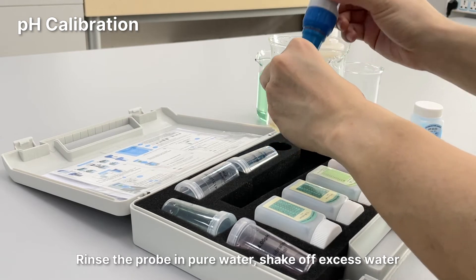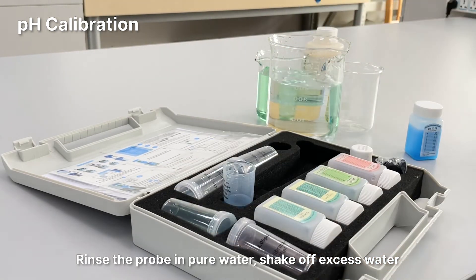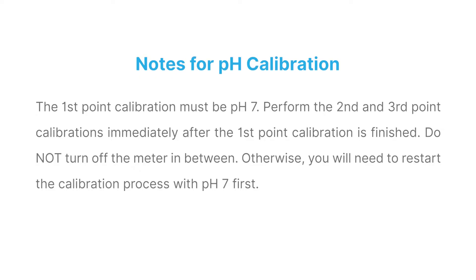Rinse the probe in pure water and shake off excess water. Notes for pH calibration: The first point calibration must be pH 7. Perform the second and third point calibrations immediately after the first point is finished. Do not turn off the meter in between; otherwise, you will need to restart the calibration process with pH 7 first.